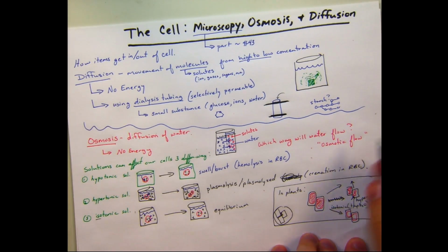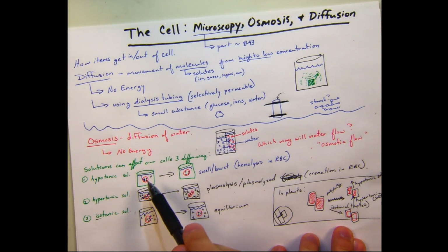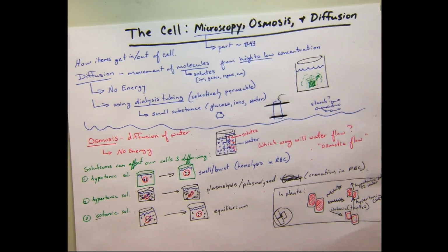what we're going to do is you are going to put it in a hypotonic solution. Now, if you come over here, a hypotonic solution is water that doesn't have much else in it. Clean water. So we're going to be using DI water. It's referring to deionized. It might say distilled water. It just means it's very pure. It's very clean.